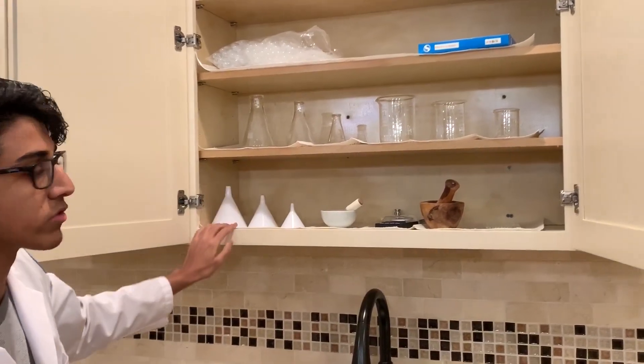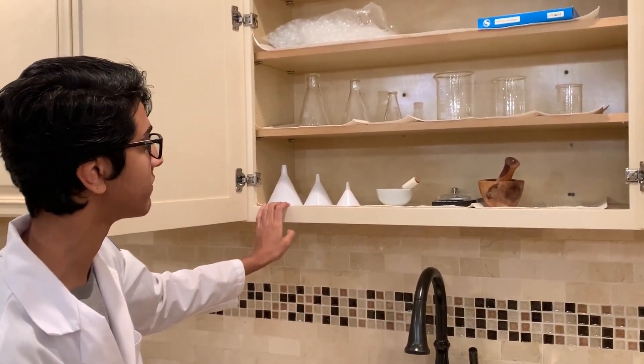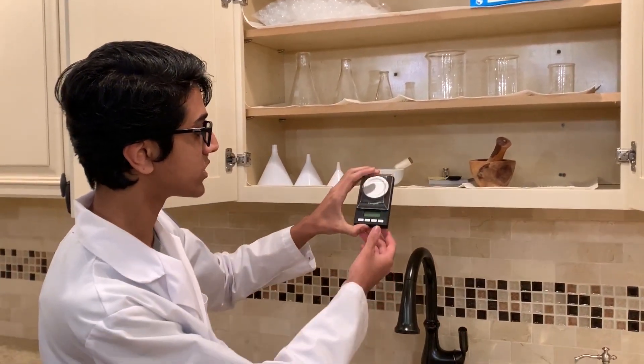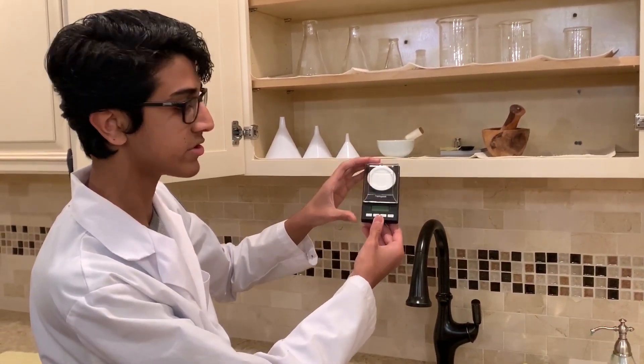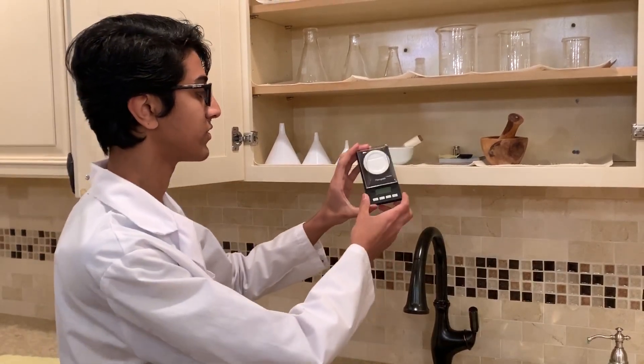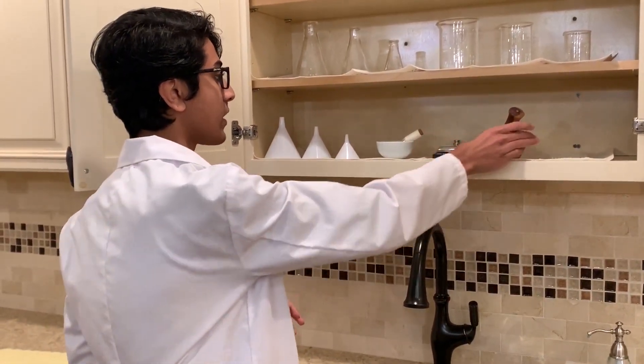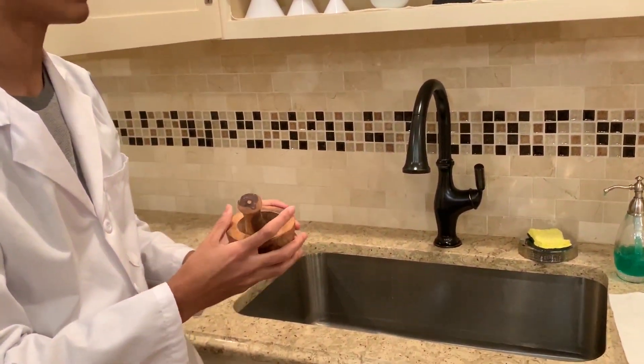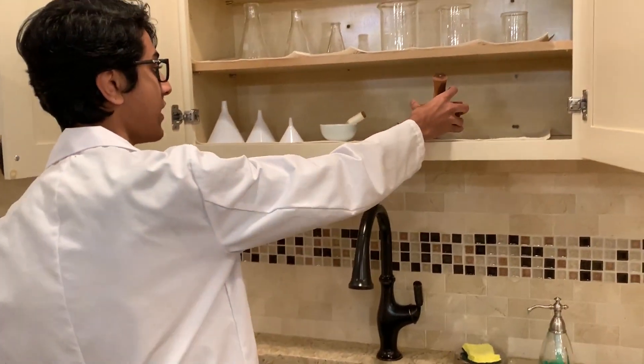Over here I have three funnels — all you really need is one, but it came in a set of three. And I have this kitchen scale which gets the job done for measuring things out at small scale. I have a mortar and pestle, which is good for grinding things up and making the reaction rate faster.